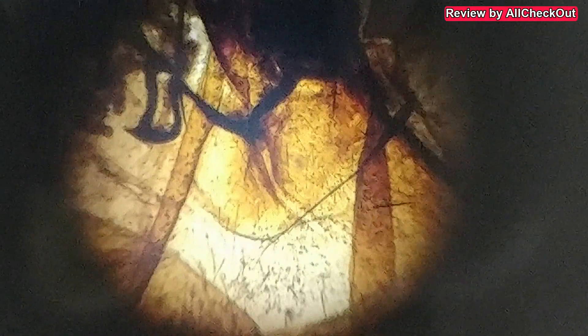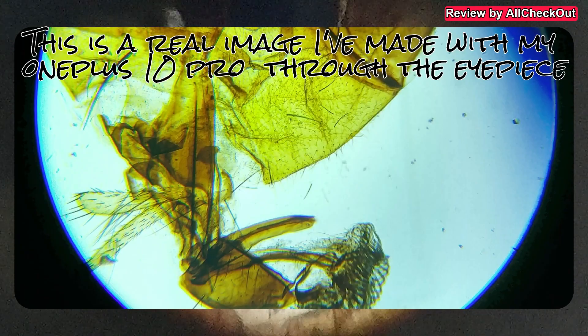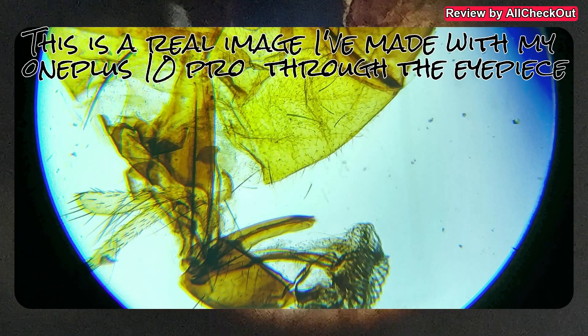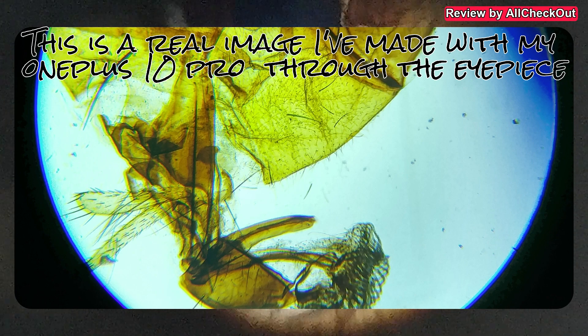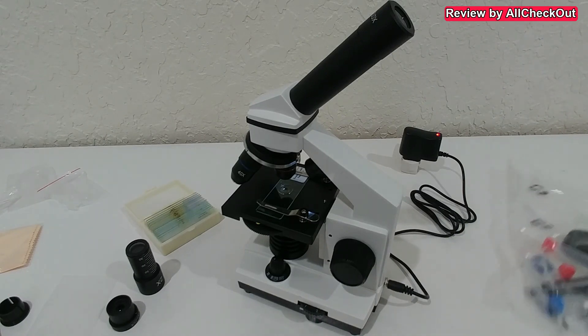Of course there's no zooming — you have to decide on the magnification, and if it's not fitting you have to switch, but it's an easy job to do. There's no way we can get to the same clarity on camera as when looking with your own eyes. The really cool thing is that you can see clearly even if you are wearing glasses, because we can adjust the focus here to make it exactly as clear whether you're wearing glasses or not.